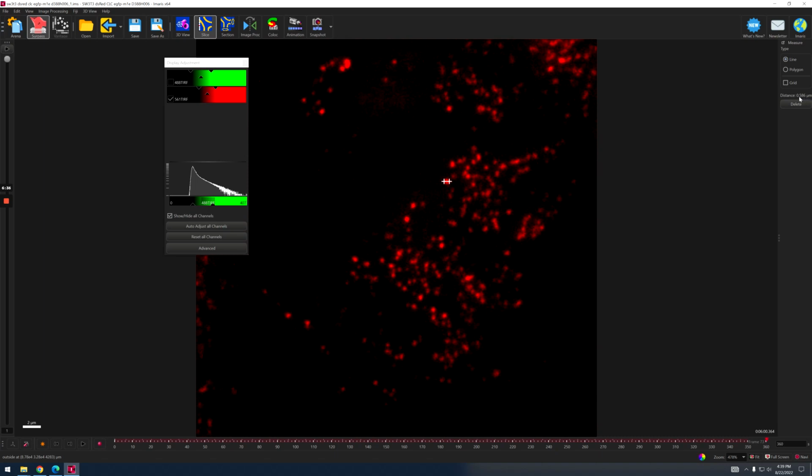For example, this one is 0.586 micrometer, so perfect. That's exactly what I was thinking about my object size. And this one is 0.6, but I made it a little bigger, so 0.5. So they are all around 0.5. That's why we made it 0.5, and in Jubin's paper they also use 0.5 micrometer.